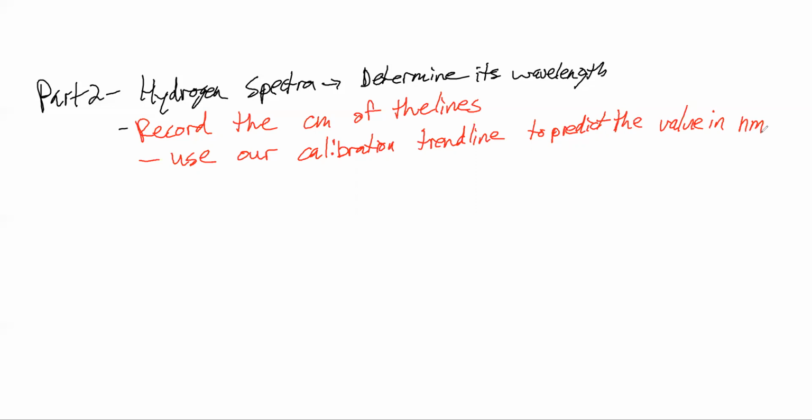So let's say, for an example, we had measured something that was 3.0 centimeters, and we had a trend line from our graph before, as y, which is basically our wavelength, being 101.3x plus 2.7, right?